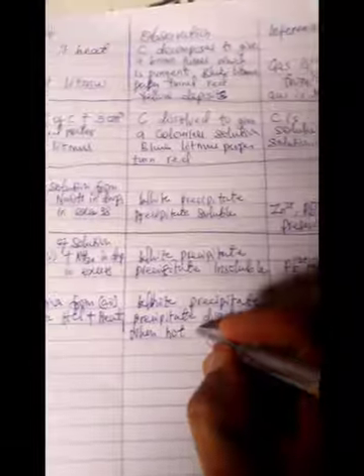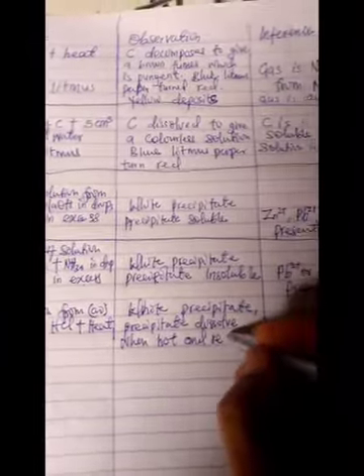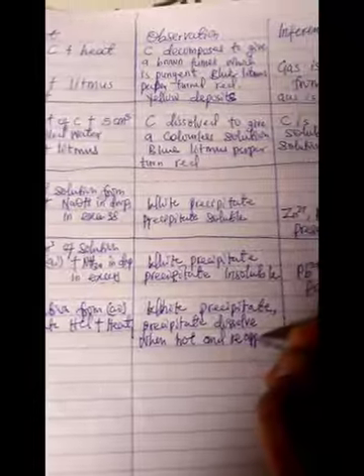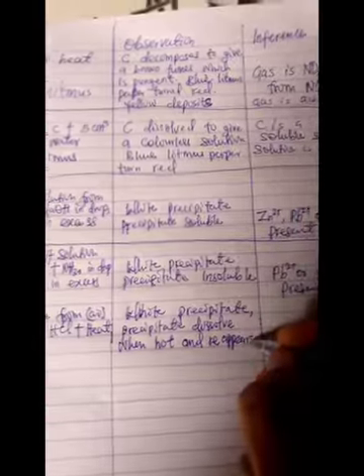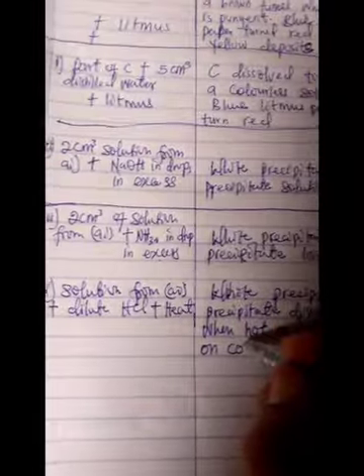Some can say soluble when hot. So you saw when I was heating it the other time, if I remove it, it will be white. If I put it on the flame again, it will be yellow. Precipitate dissolves when hot and reappears on cooling. That is the confirmation. On cooling, it will reappear.